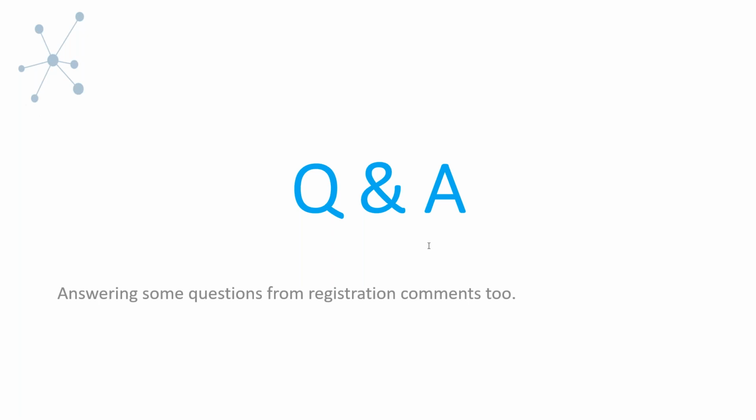So then there's a general question asking about performing method validation and method development. So that's very specific to the types of samples that you're dealing with. So when you want to specify the method that you want to use and validate, it's really going to be dependent on, you want to ask yourself some questions to get to that point. So obviously you know what samples you're working with, and so what you really need to understand is what you're trying to learn about these samples.